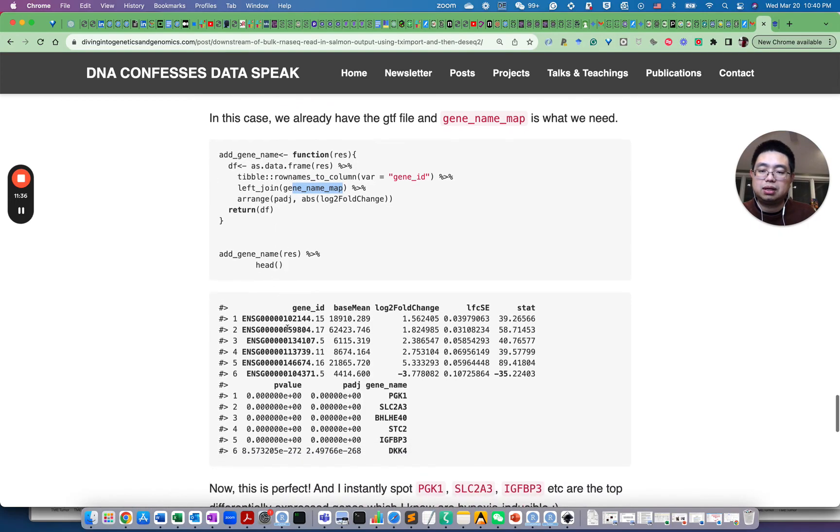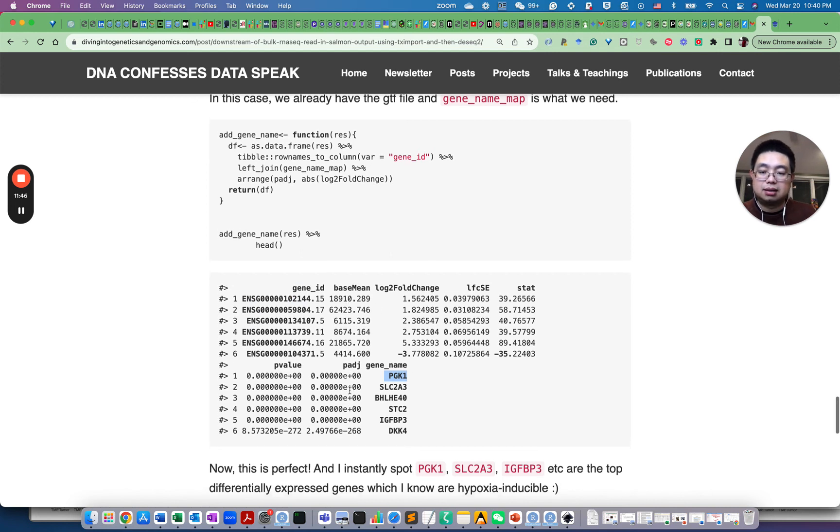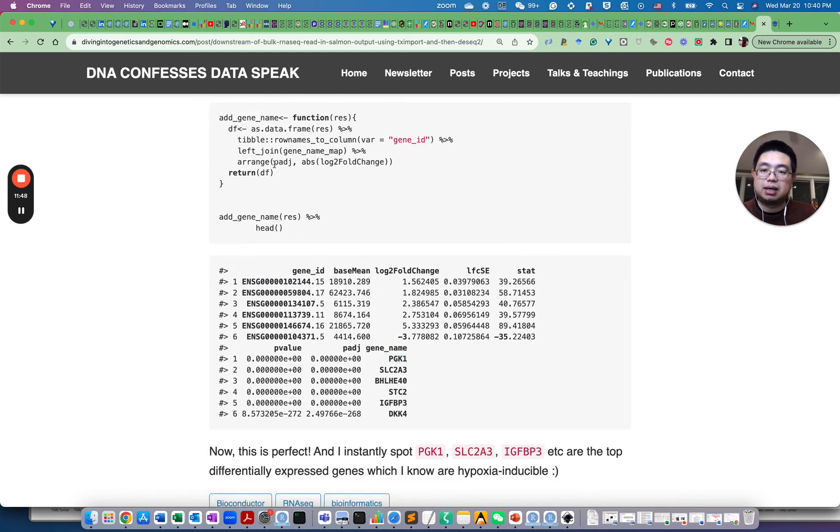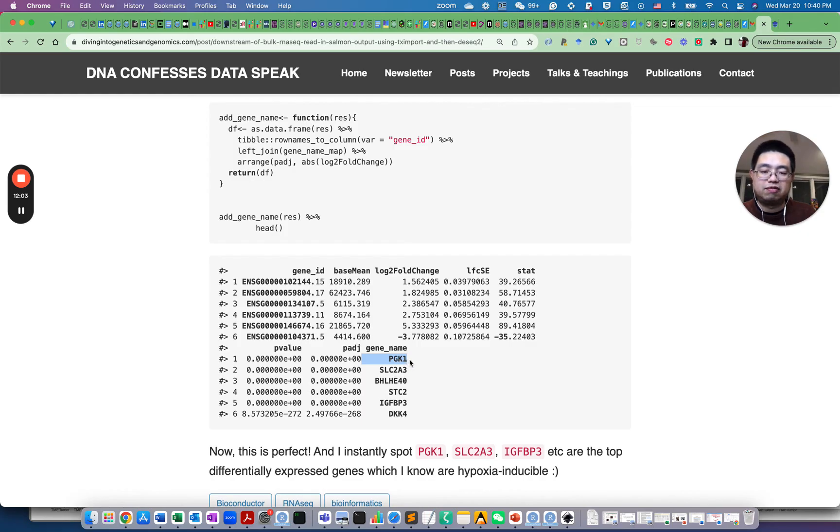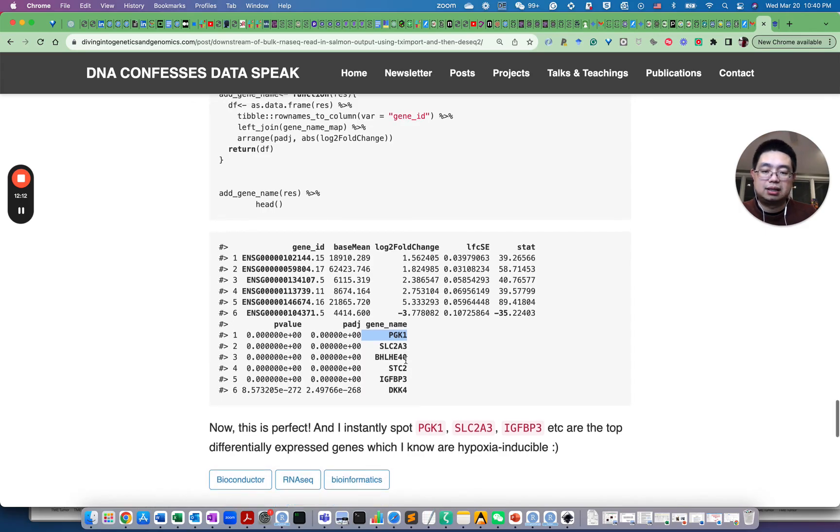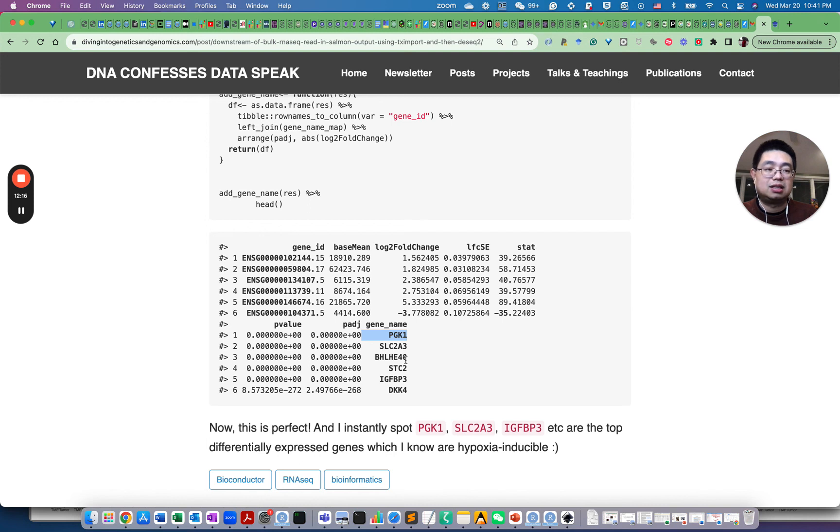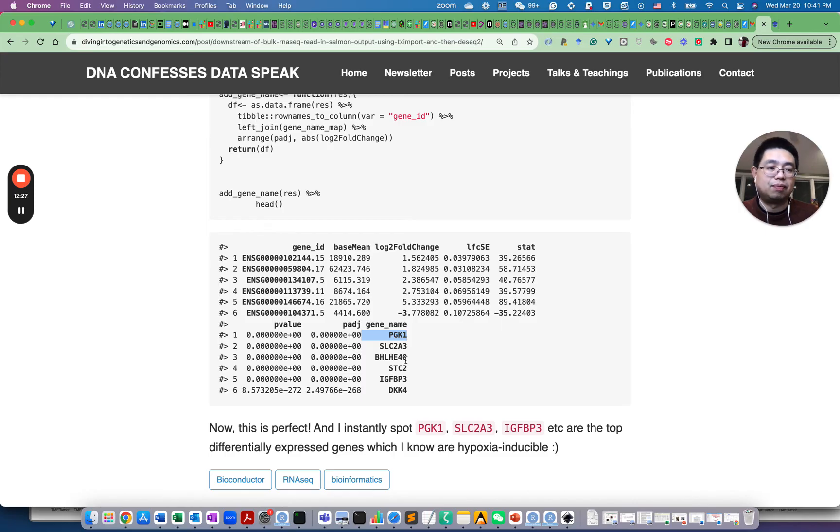So if we do this, look at the first six rows, and now we have the gene ID here, but now we also have the gene name here. And this is also sorted by the P adjustment value, adjusted P value, and then the absolute log two fold change here. And surely I see those familiar gene names called PGK1, IGFBP3, and SLC2A3, which I know they are hypoxia inducible and they are the top differentially expressed genes in this experiment. And I know that experiment worked. So always do a sanity check when you see the results and talk to a biologist if you don't know enough of the biology background.